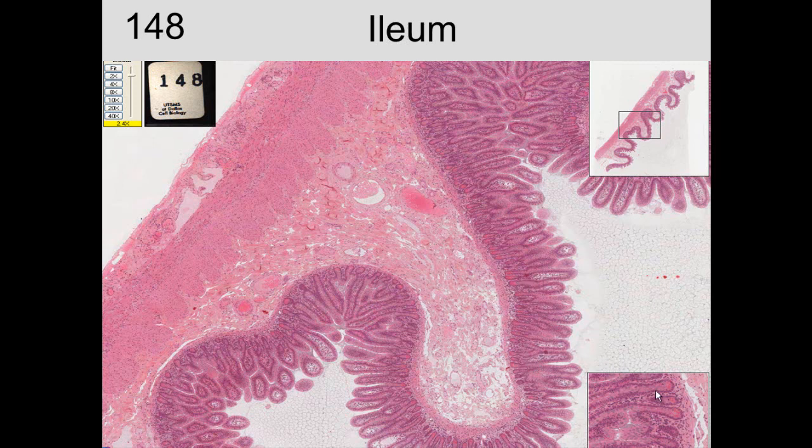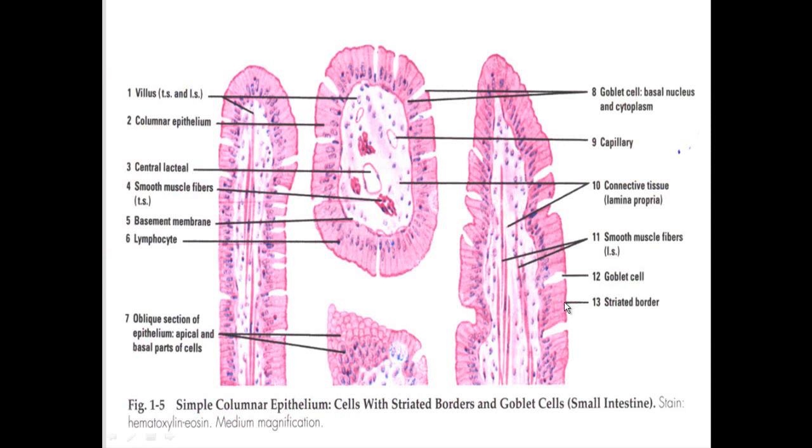We're working in this area right here, which is what we see in the intestinal absorptive cells. As you get down toward the base of these cells, you can see there are other cells that have a different type of characteristic of staining. So we have the lumen, the outside of the gut, the muscle layer of the gut, the connective tissue of the gut, and the epithelium lining the surface of the gut. So here we can see again a closer view.